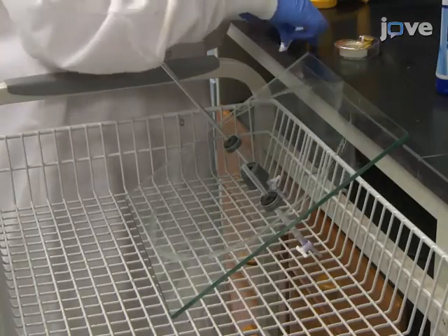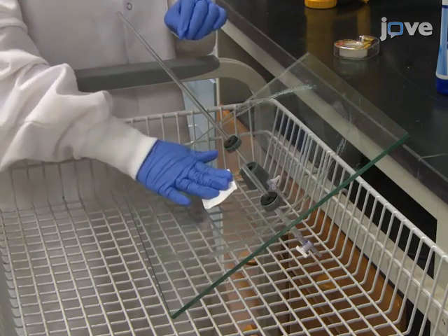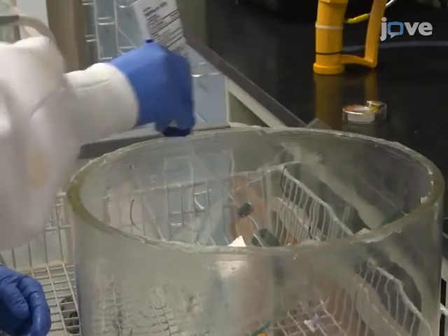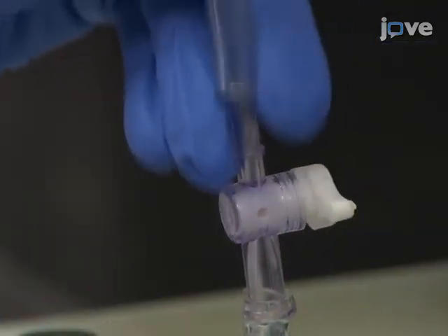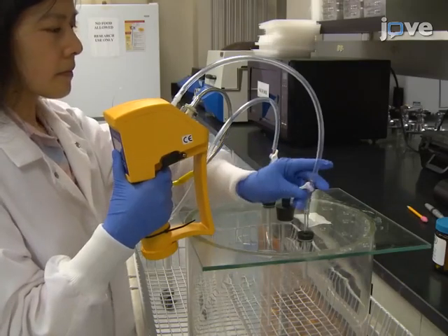Before beginning the procedure, attach the chlorine dioxide pouch to the lid of the glass chamber with double-sided tape and seal the chamber with petroleum jelly. Connect the inlet and outlet of a chlorine dioxide gas detector to the chamber and switch on the inlet and outlet gas flow.